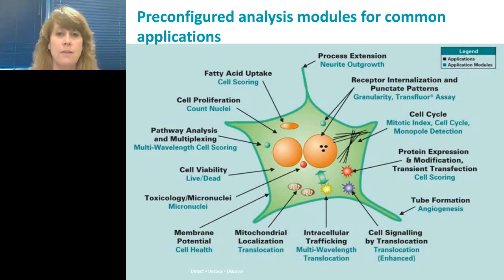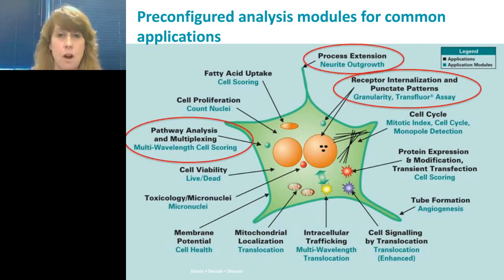Then you have the choice of using pre-configured application modules in MetaXpress software for finding some of the common processes you might want to use. I used some of these modules in a custom module where I could actually measure everything in one analysis this way.